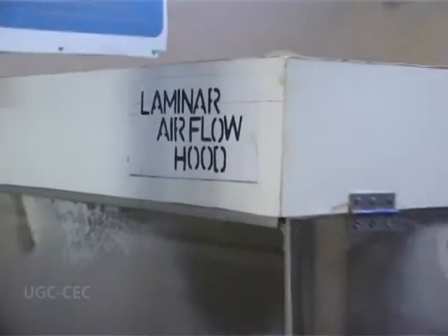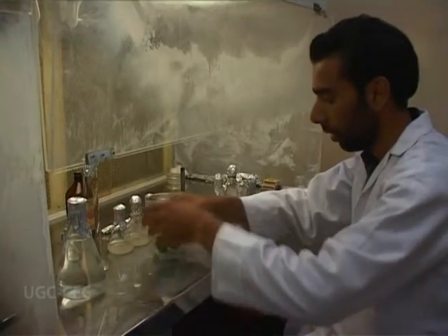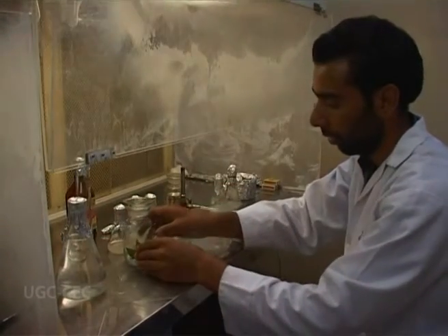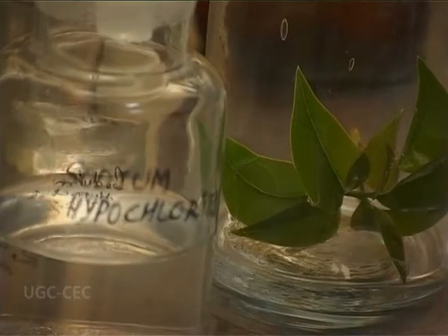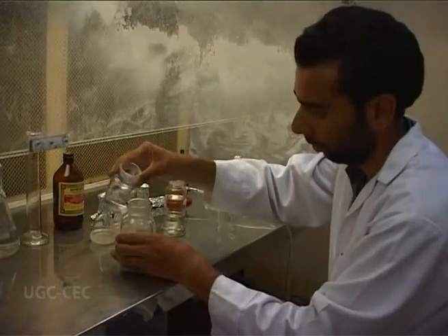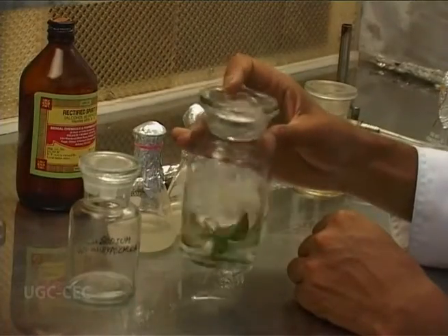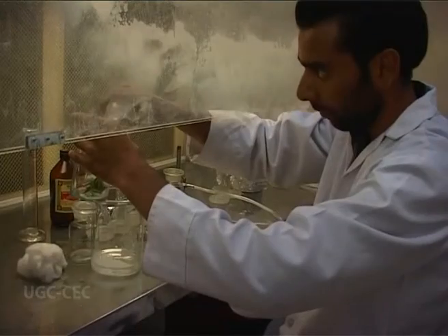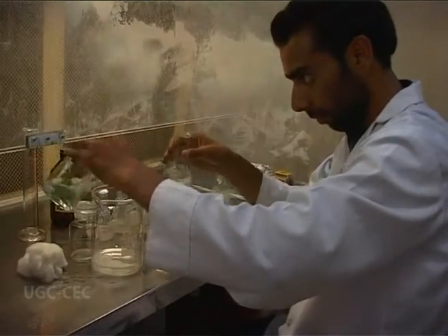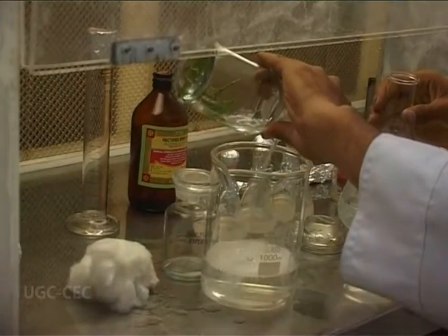All the subsequent steps are carried out in aseptic conditions, which are provided by a laminar airflow hood. Plant material is taken in a sterilized bottle and then treated with a sterilizing agent like sodium hypochlorite, bromine water, mercuric chloride, etc. for a suitable duration of time. Once the chemical treatment has been given, the plant material is rinsed 3 to 4 times with double distilled water.